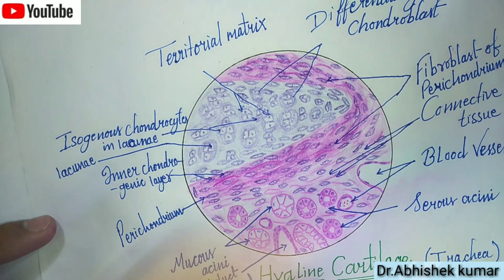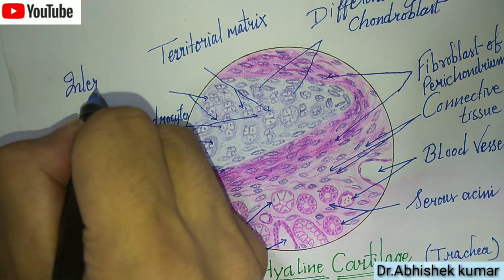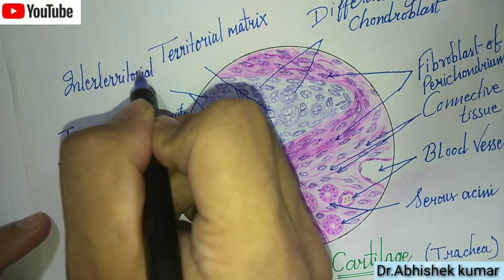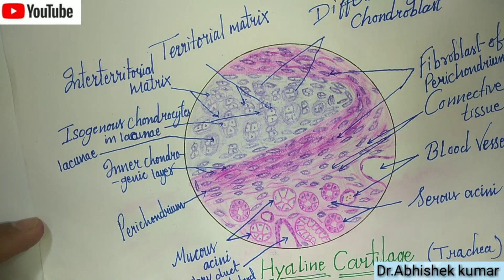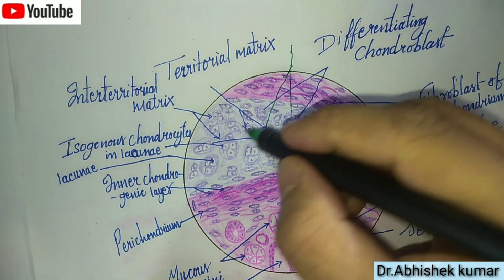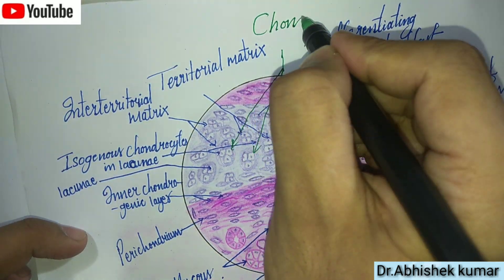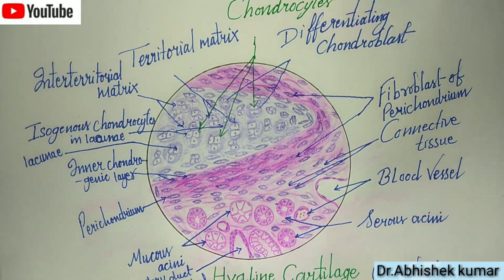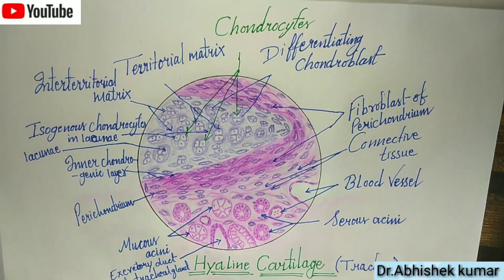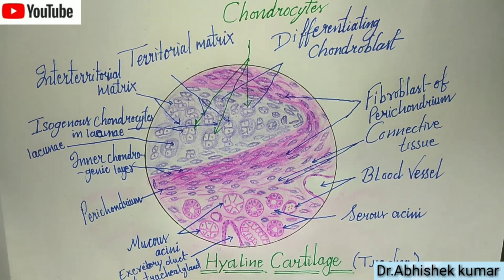This one is the territorial matrix, and here is the interterritorial matrix. All of this together is called the chondrocytes. This is complete.